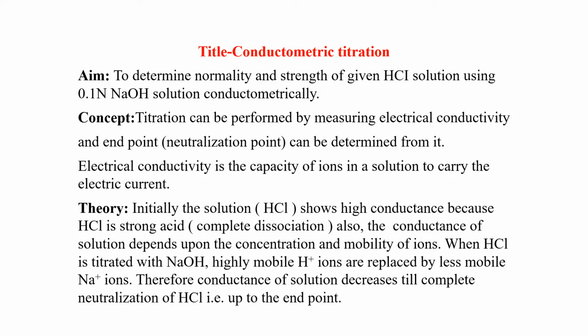Now the concept of this practical is, this titration can be performed by measuring electrical conductivity, and from that we can determine the end point or neutralization point. Electrical conductivity is the capacity of ions in a solution to carry the electric current. Now we will see the theory of this experiment.